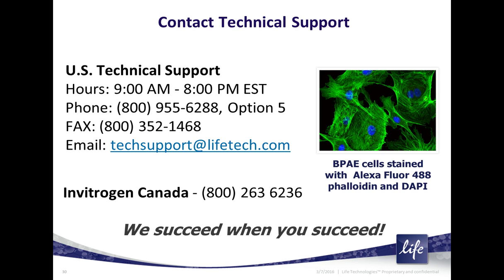It can be done, and I've done it, but those are some concerns, mainly about the dimness of the direct conjugates. Now, direct conjugates are very often used in flow cytometry as opposed to microscopy. Flow cytometers are more sensitive, so the dimness is not as much of an issue. Plus, a great deal of flow cytometry targets are cell surface antigens, so penetrance is not as much of an issue.